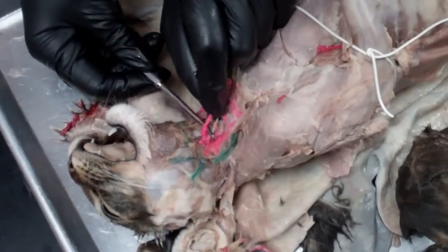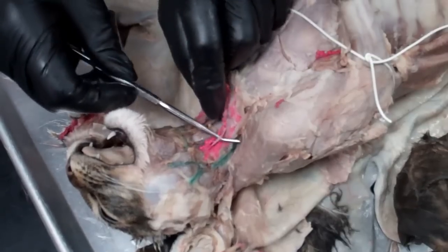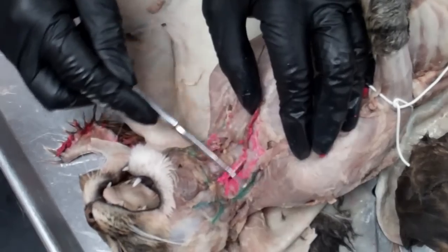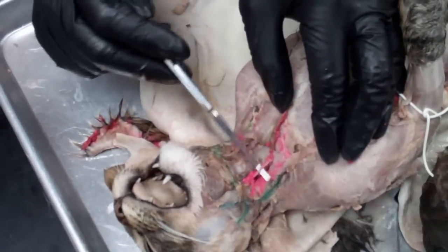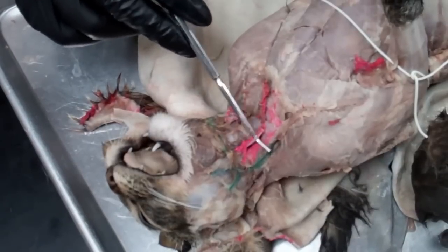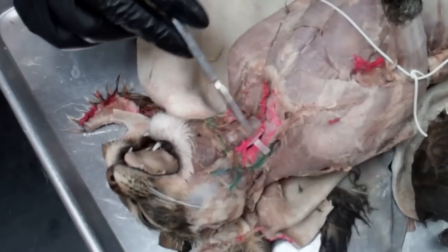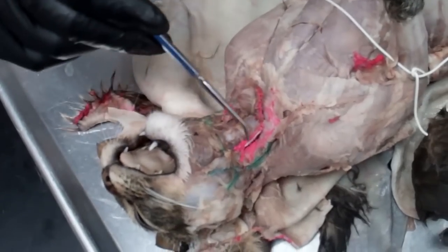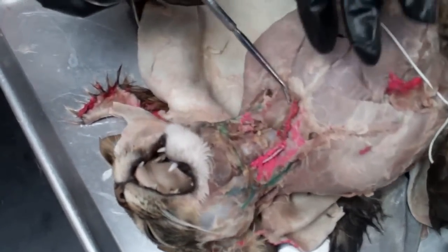Just underneath the carotid artery, there's a little white structure that you'll need to separate — that is the vagus nerve. That nerve goes down and controls the whole digestive system input from the brain and also controls the heart, so it's a very important nerve. On this right side we have the right carotid and the vagus nerve.